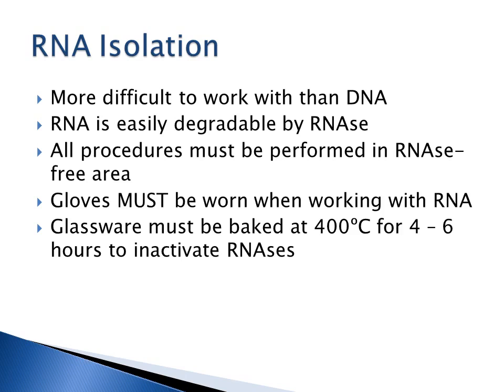So there are specific procedures that must be followed if you are doing RNA isolation. Usually people working with RNA have a specific room, an RNA only room. And this room is RNase free, or as RNase free as it can be. So you can buy these solutions called RNase erase, and you could spray it to remove all the RNases from the environment. When you are working with RNA, you're always going to use gloves.